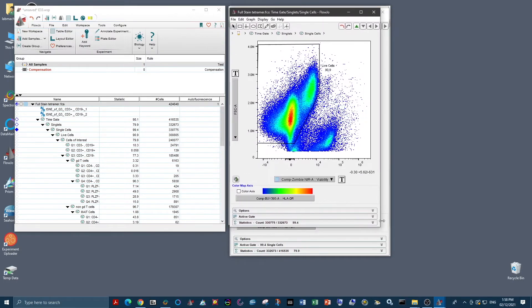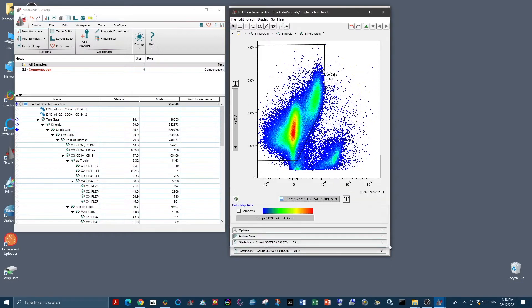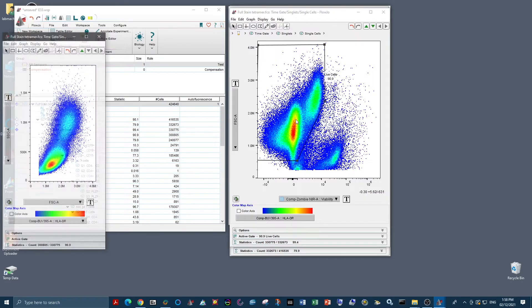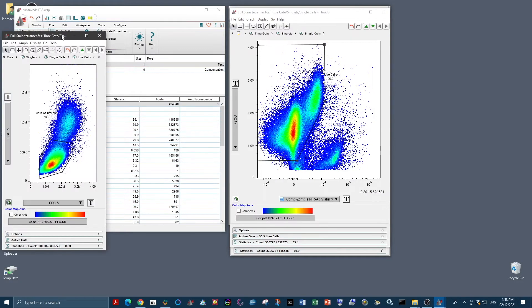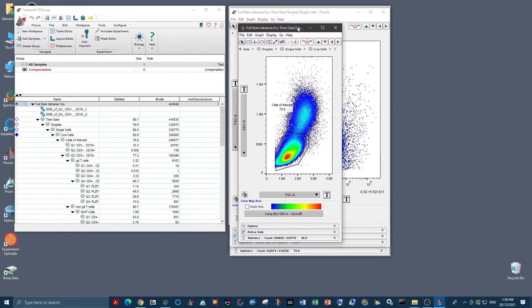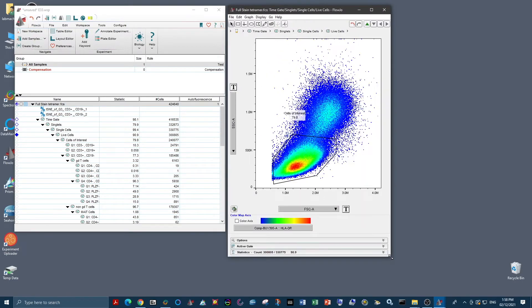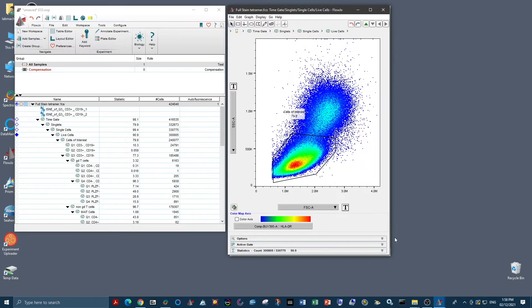Then we gate on our live cells, so our viability negative and forward scatter high non-debris cells sitting here. Then our cells of interest. So again, this panel is only looking at T cells, so our cells of interest are our lymphocytes.